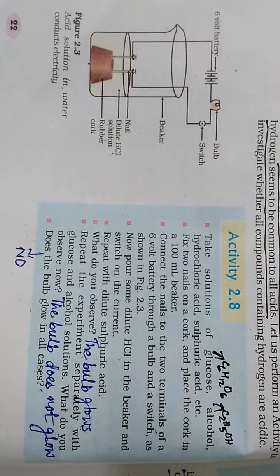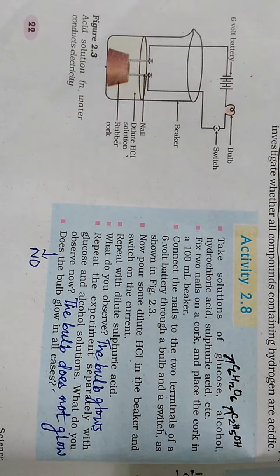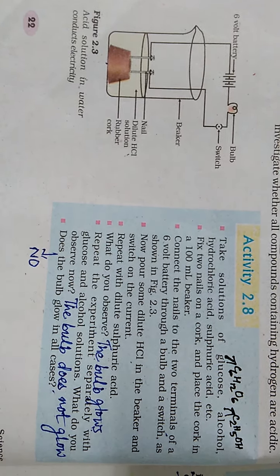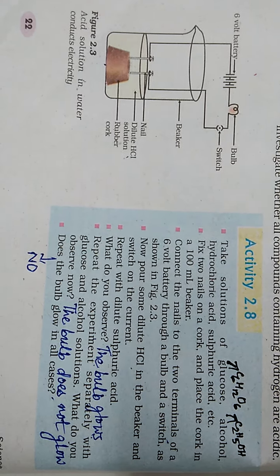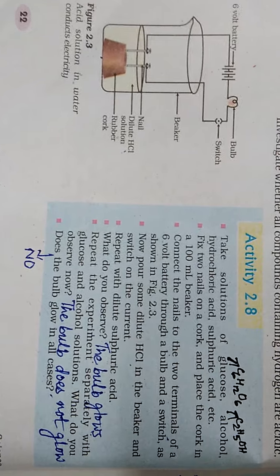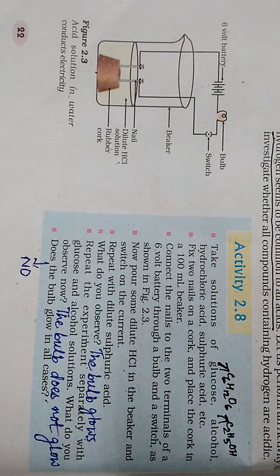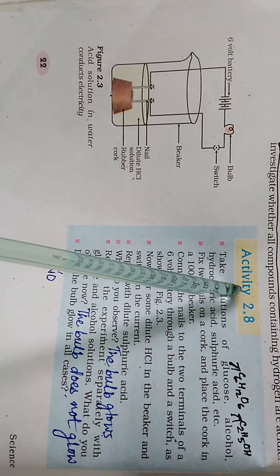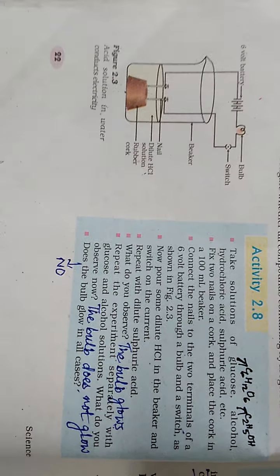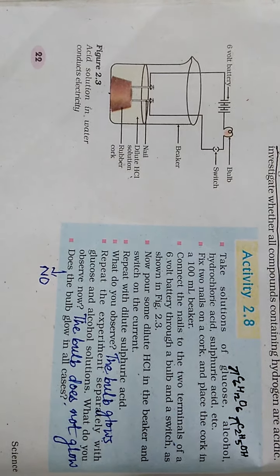You know that all acids generate hydrogen gas on reacting with metals. This observation shows that hydrogen is commonly present in all acids. But does it mean that any chemical substance or compound which contains hydrogen is capable of showing acidic properties? Let us find out. We'll perform activity 2.8 to understand why all substances which contain hydrogen cannot conduct electricity like the acids do.